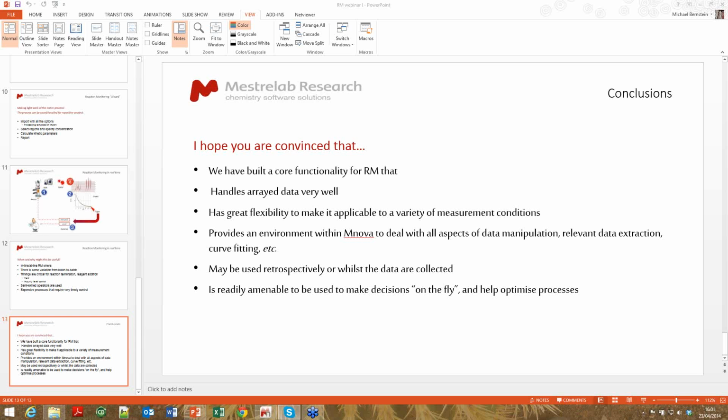We've got lots of questions here. Can this import reaction monitoring data as a Bruker serial file, a pseudo 2D array, from Simon Watson? The answer is yes. So you do it in a similar way to the way we did the Varian data. How well it would read the time axis there is probably debatable, and you may well have to specify the time in the way that I alluded to.